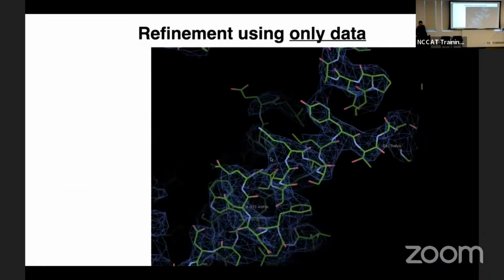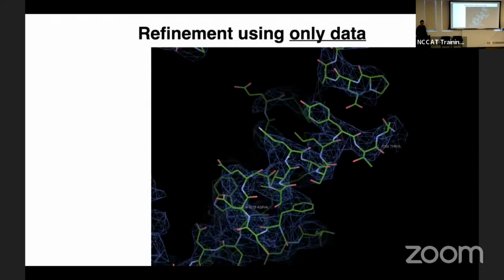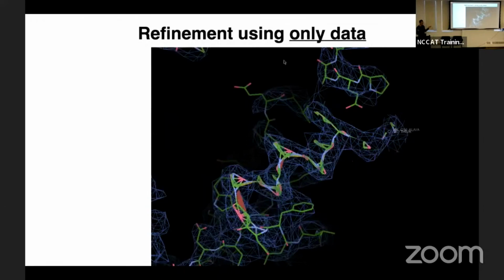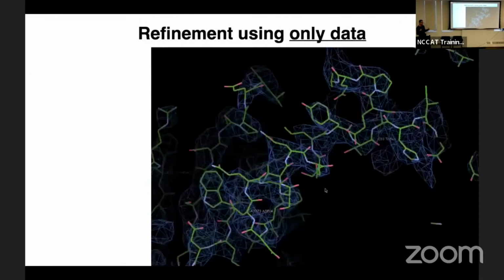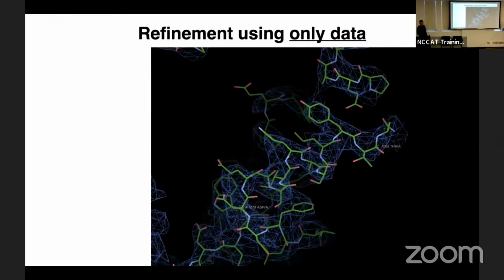And I think this is a similar sort of movie, doing this with a whole alpha helix. So if we turn off the restraints and try to just real space refine this region in COOT, you can probably guess what happens, right? We get something that still kind of follows the density. So it's consistent with the data, but definitely is not what a protein should look like.